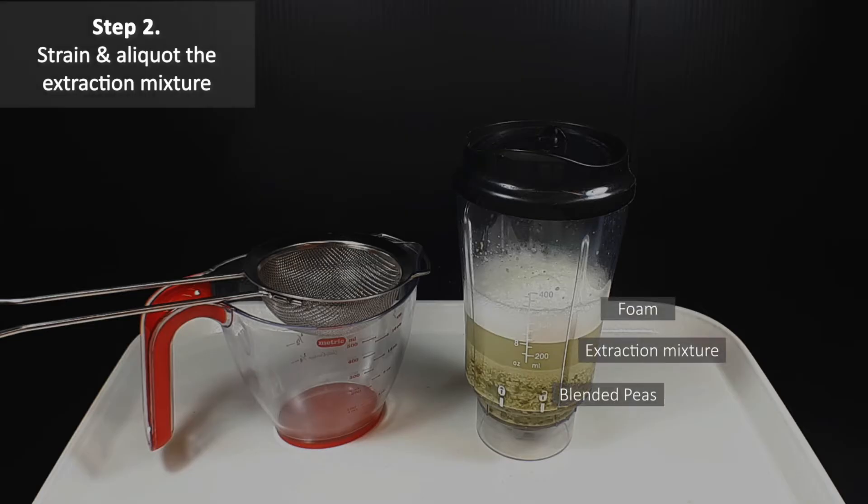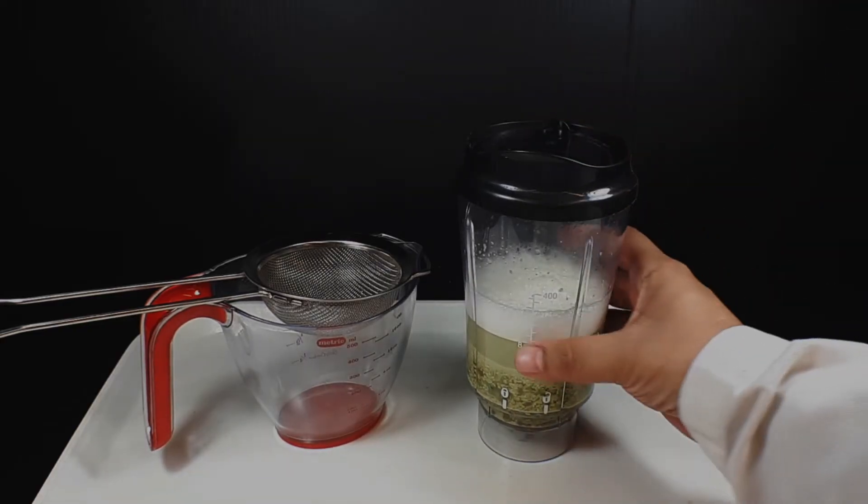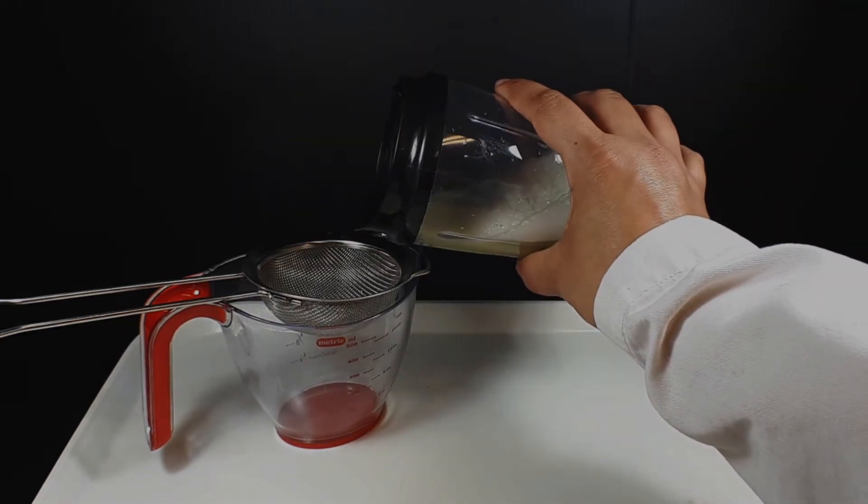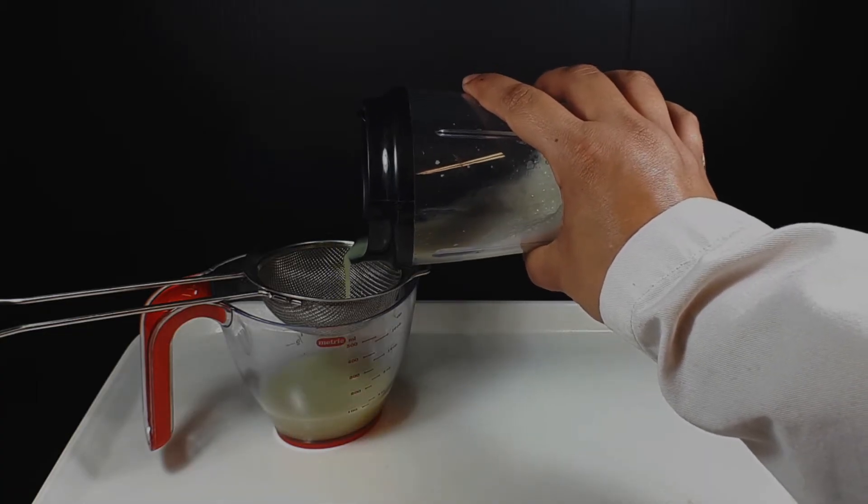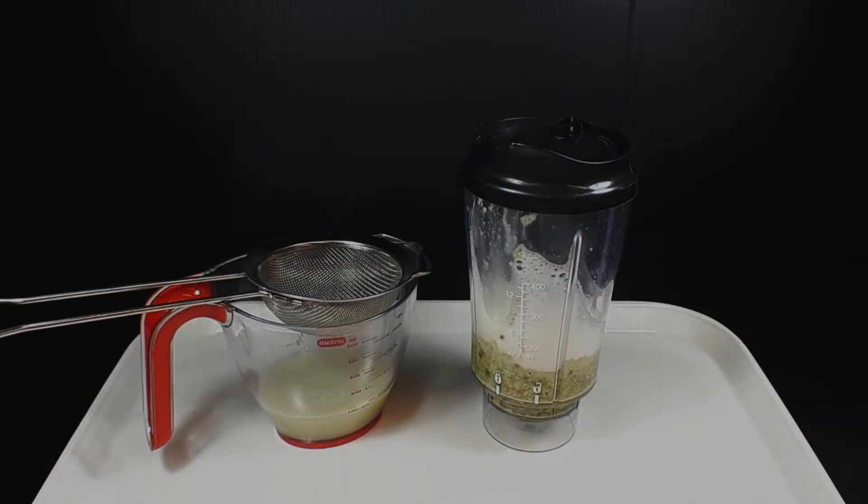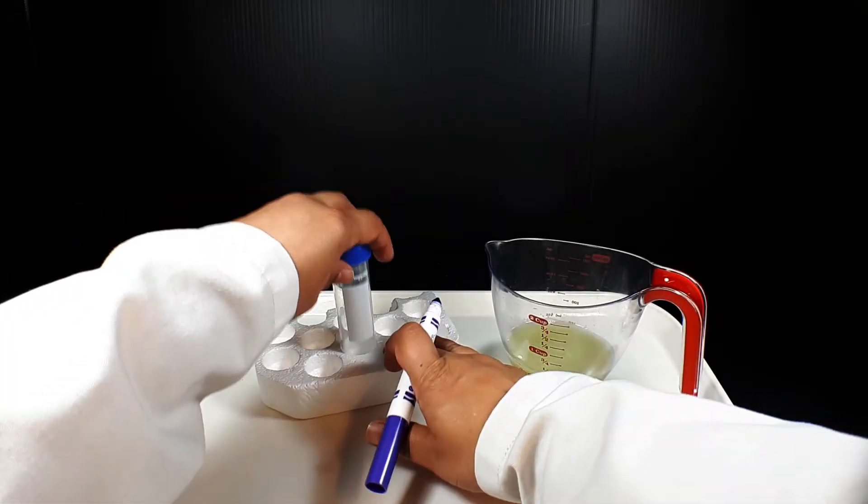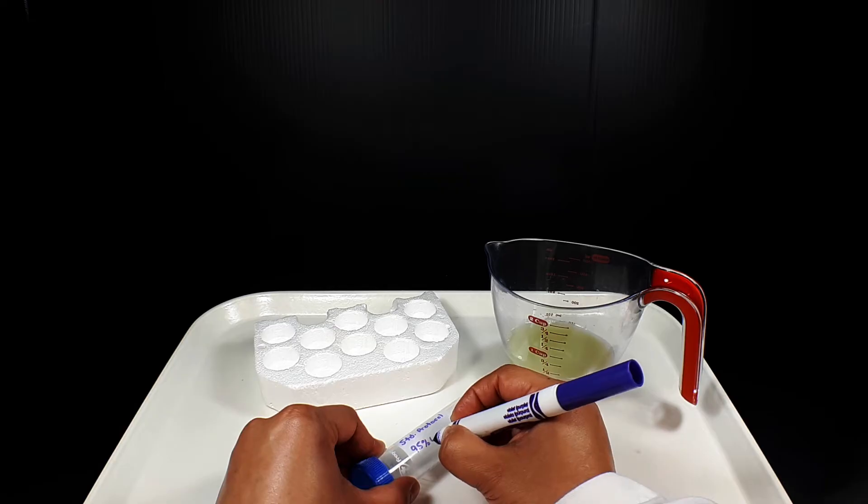After blending you'll notice the chopped up split peas on the bottom, a watery greenish layer in the middle, and a foamy layer on top. For our DNA extraction we only want that watery greenish layer in the middle. So our next step is to carefully strain the extraction mixture, leaving the foam and the chopped up split peas behind. Now we can label our tubes and aliquot 15 milliliters of the strained liquid.